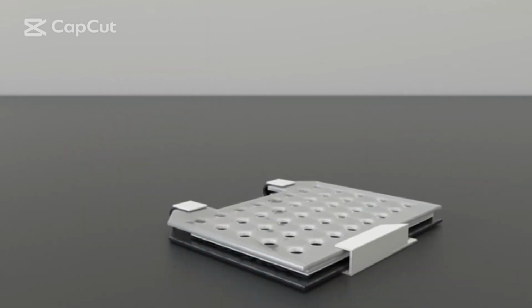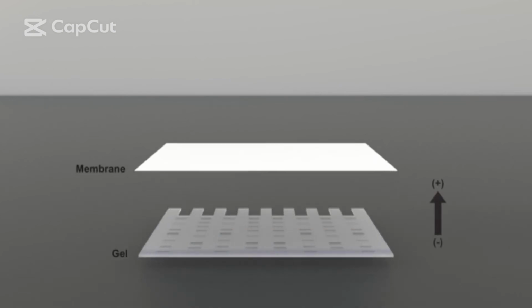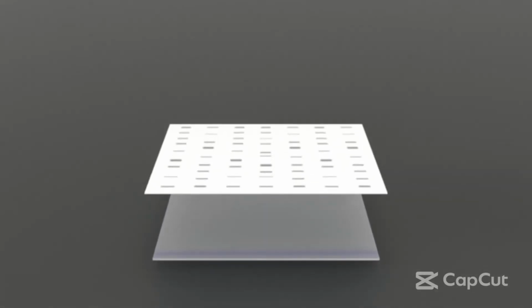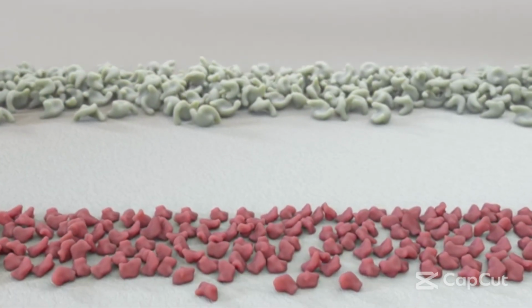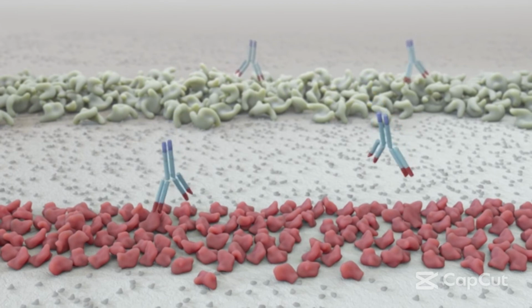Before the separated proteins can be visualized, they are typically transferred using electrophoresis onto a nitrocellulose membrane that is more durable than the gel. Next, the areas of the membrane that do not have bound protein are blocked to prevent nonspecific binding. Then, antibodies to the protein of interest are added.